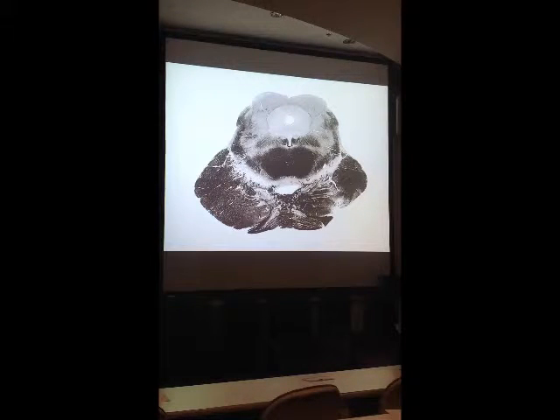So this is another section I think you should be able to write down as midbrain, slide cartoon 23, page number 23. Again, key here is the cerebral aqueduct and a very nice distinctive periaqueductal gray. If you see those structures, generally you're in the midbrain. Although there is a little bit of pons here, some of the basilar part of the pons was grazed by the section. This is the cerebral peduncle, and the major, mostly motor control group of neurons that form the nucleus here is the substantia nigra.